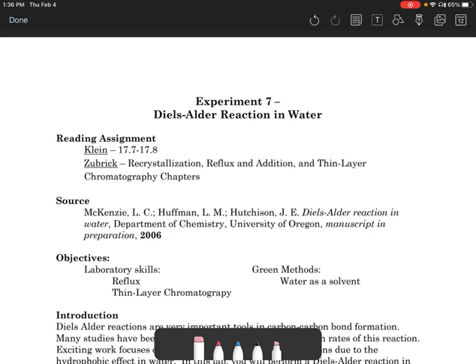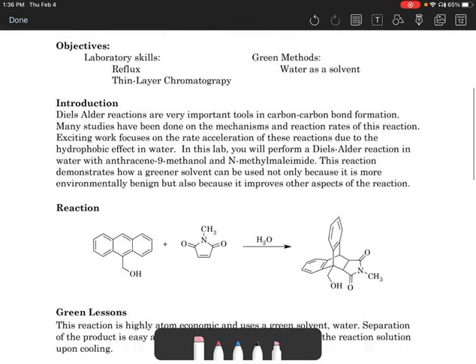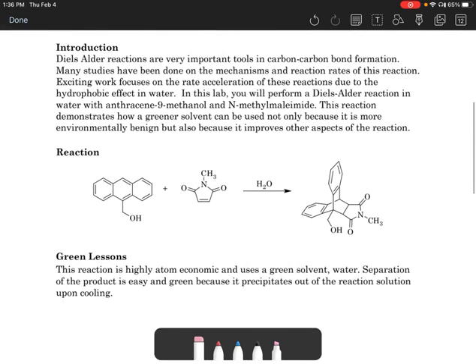Hi everyone. In this lab, we're going to perform a Diels-Alder reaction in water. So this is a very green reaction because instead of using a solvent that could potentially be hazardous, like dichloromethane, we're just using water. So in the introduction of this lab, you're told that Diels-Alder reactions are very important tools in carbon-carbon bond formation.